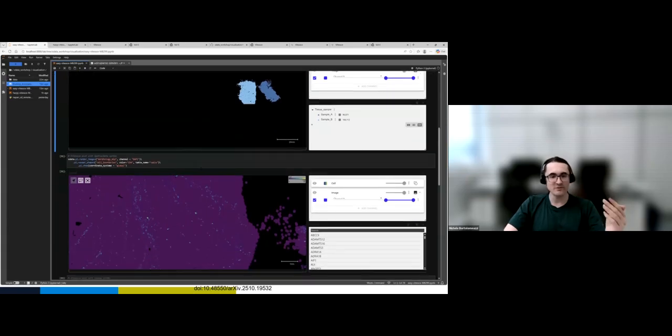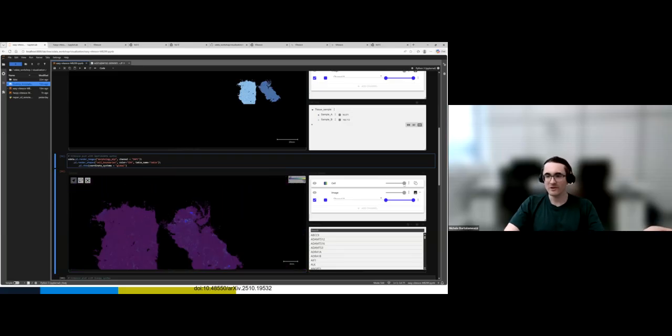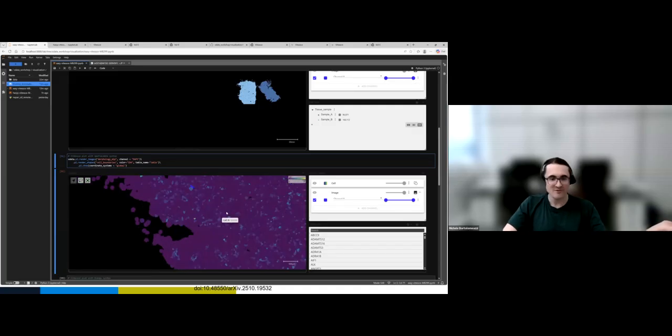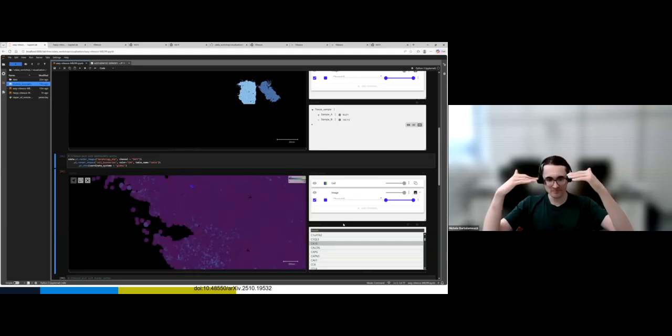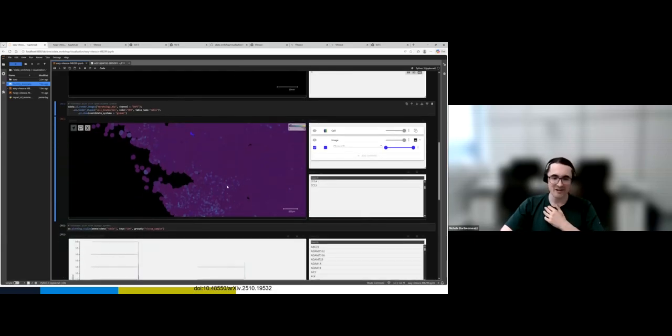And then, of course, I can do the same thing, but I can select the gene that I want to display. In this case, I'm always picking CD4 for this demonstration, but you can really go and select any gene from the list, and it will refresh and load. So instead of replotting the same thing over and over, it's quite quick.